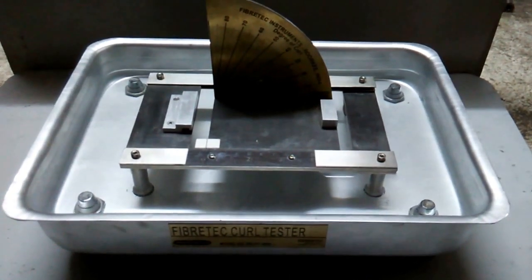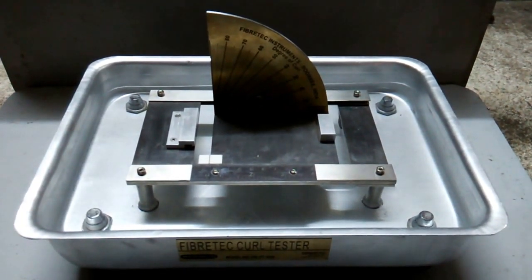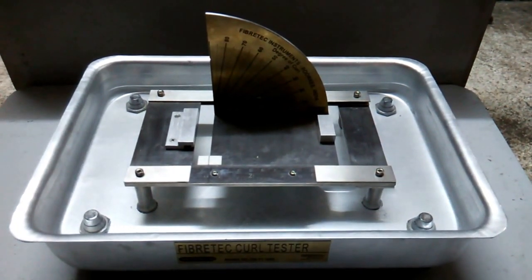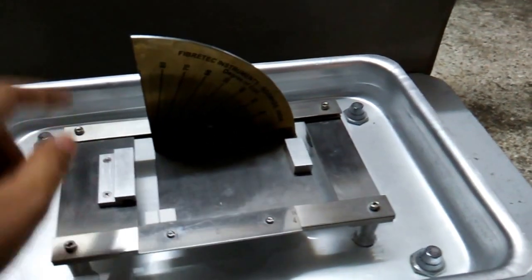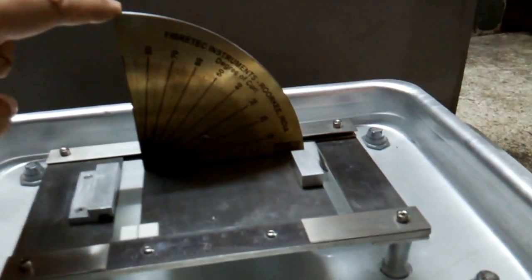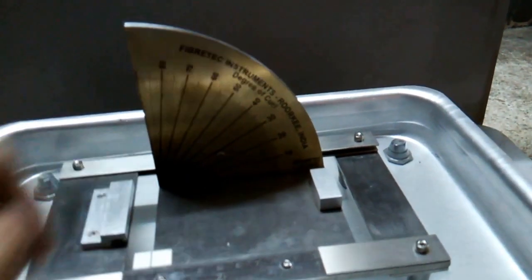Welcome to the Fiber Tech Curl Tester. This instrument is basically for determining the degree of curl in paper. You can see this is the curling scale — it shows 0 to 90 degrees of curling.